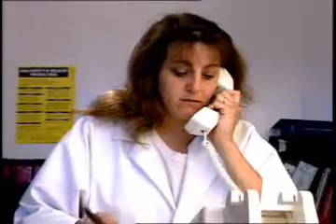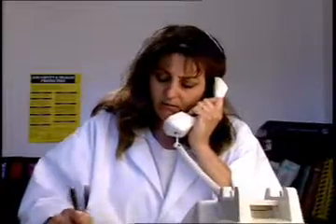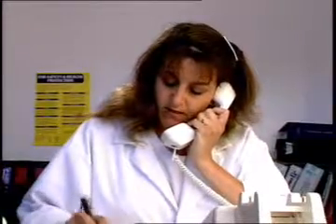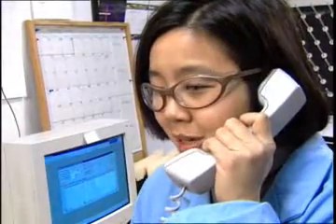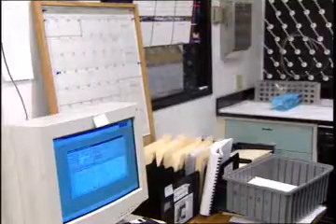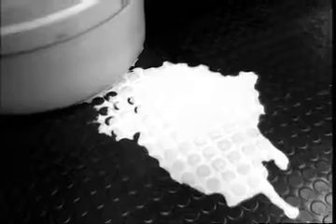Hello, this is Linda. There's a leak in the hazardous waste drum. Methylene chloride and sodium sulfate. Your facility has designated an individual, titled Emergency Coordinator or something similar, who should be notified whenever an emergency occurs. He or she is trained and responsible for taking charge of emergency response actions. At least one emergency coordinator is either on duty or on call at all times. Contacting the coordinator or the communications center quickly with a clear, comprehensive report of the incident will speed the overall response and reduce the risks to people and the environment.